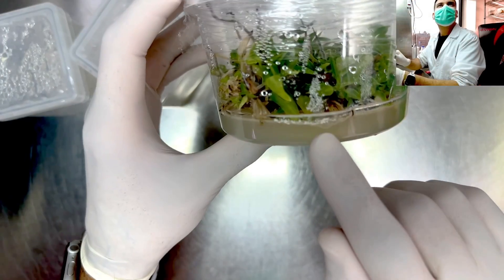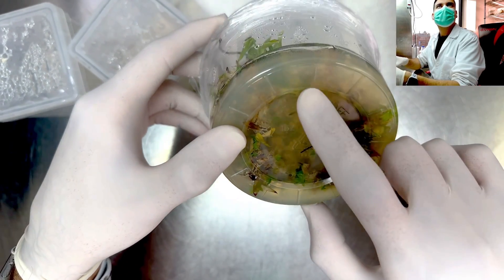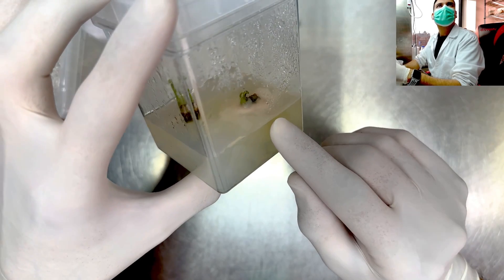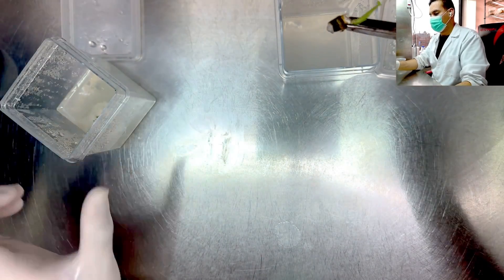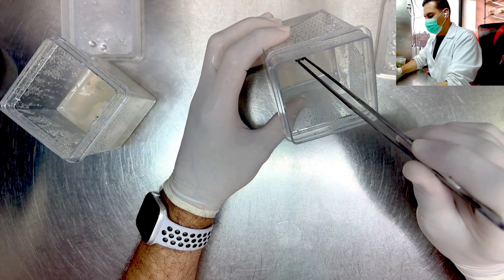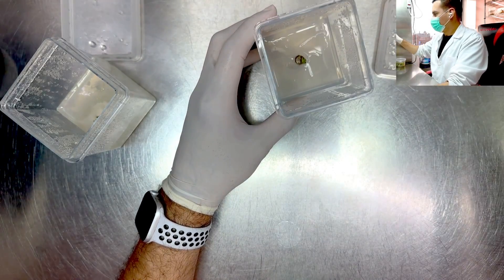Spotting and avoiding contamination. Contamination can be one of the biggest challenges in tissue culture. Keep an eye out for mold or bacteria growing in your culture, especially in the first 2 weeks after initiation or subculturing. If you notice any contamination, remove the non-contaminated plants and transfer them into fresh media with PPM immediately. Lightly to moderately contaminated plants can be re-sterilized following the same process as cleaning and sterilizing explants.